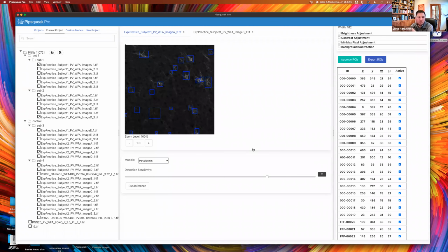In the Sorg lab, that was the type of approach that we agreed on, was that we wanted to take several microns of a Z plane and sum it together so that we were really seeing a good relative signal across all of our images, and specifically, we were not taking a max projection. We were summing our images because we felt like that was a better approach.